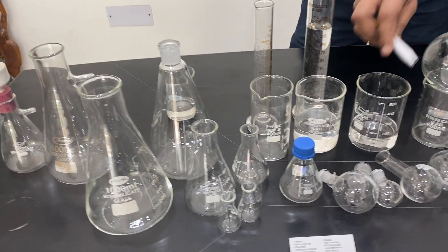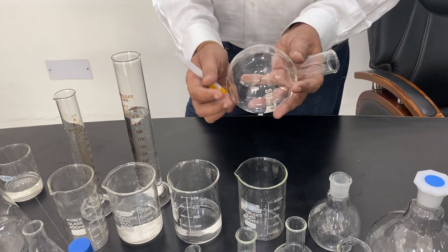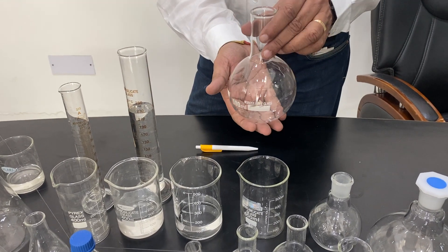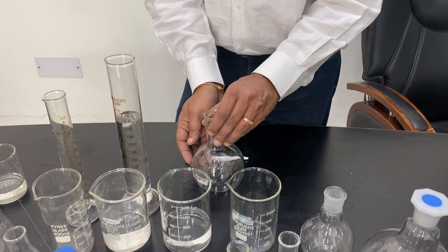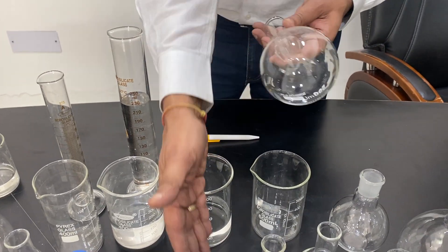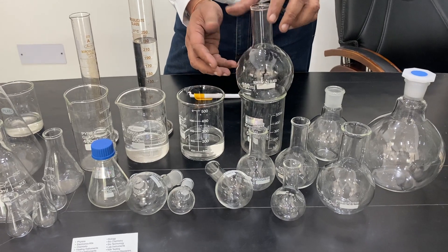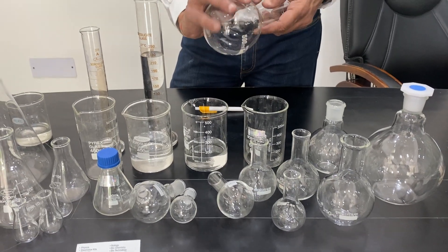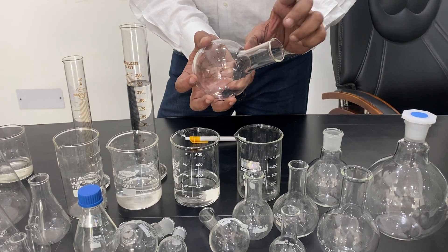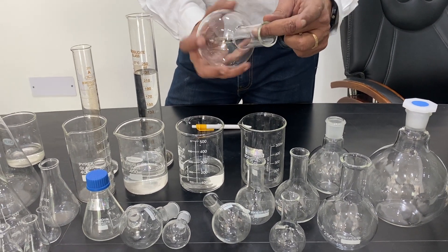Next come the round bottom flasks, also called boiling flasks — you can boil liquids in them. They cannot stand on their own and will fall, so never leave them unsupported. They should be placed on a stand or ring support. They have a round bottom with a long neck or short neck and a rim on top.